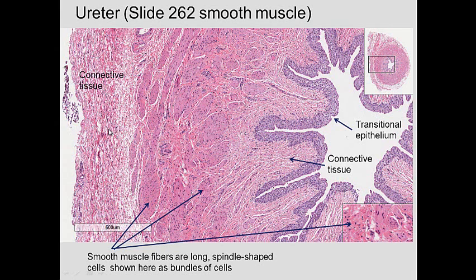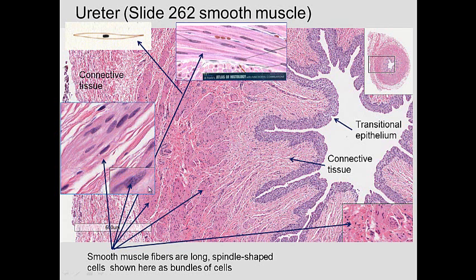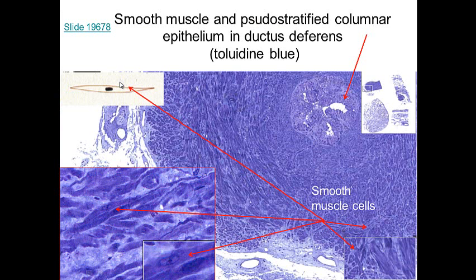So we have fibroblasts, and then we have bundles of collagen that we see there, which is lighter staining than the smooth muscle that we see here. Smooth muscle, you can see a smooth muscle bundle and individual cells there. If you look at a higher magnification, you can see individual cells. Here's a drawing that we saw, and this is the actual cell. These are nuclei, so these are multiple cells. This is an individual cell you see there, and it's non-striated.